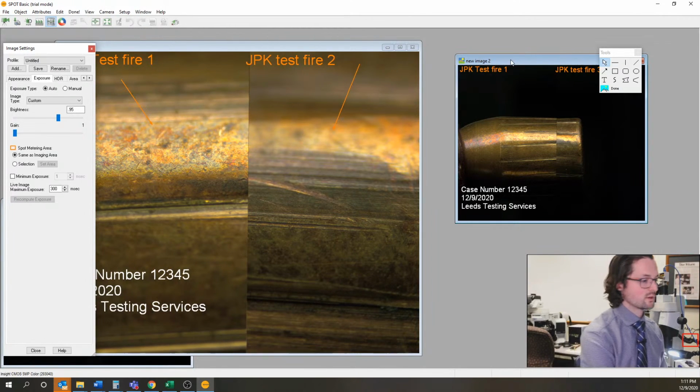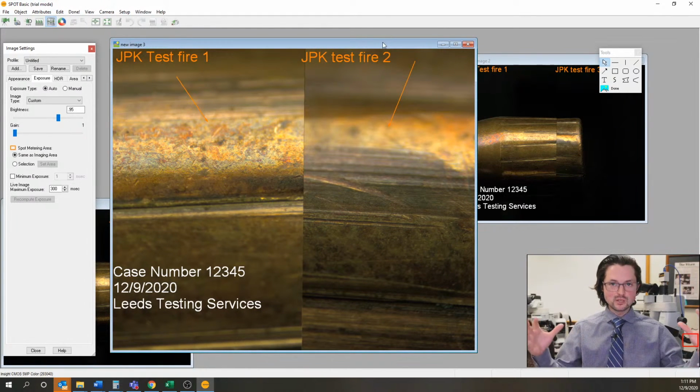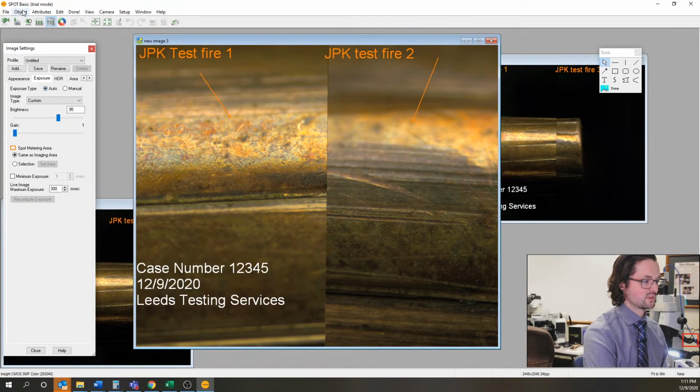Quick note, in Spot software, whenever you capture pictures and do annotations, before you can save or share those pictures with other people that don't have Spot software, you need to burn in your annotation information. This technique that we're doing doesn't work on burned in pictures, if that makes sense.